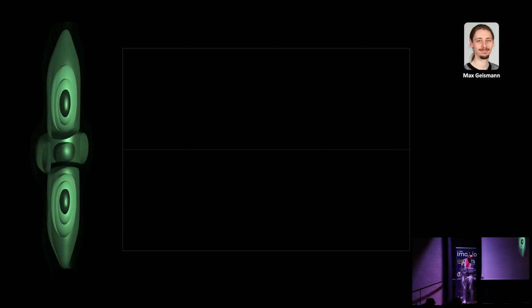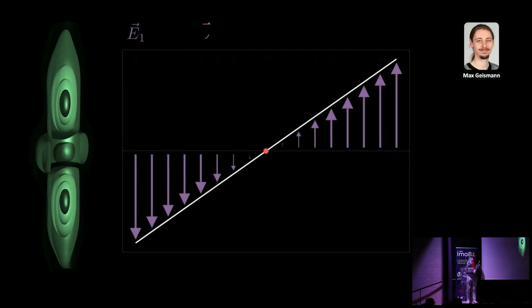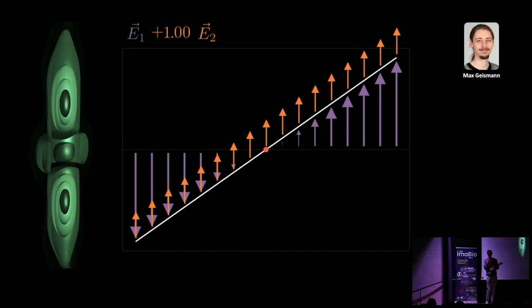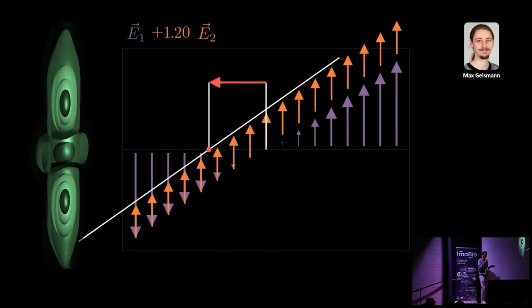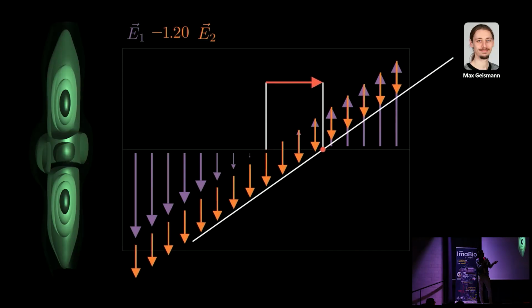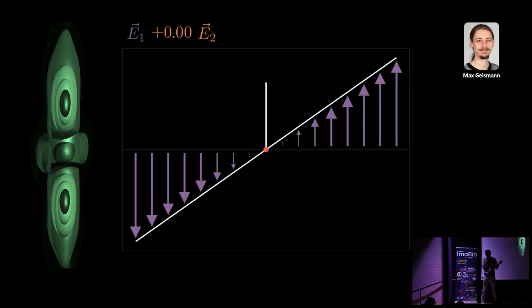And what we did is to specifically work with this beam and use an interferometric approach. So most of the zeros of intensity that you see are a crossing of electric field from negative to positive. So if you overlap this beam with a constant beam, you can just displace the position of the zero, and voila, that's it. This that you see here represents what happens in the actual direction for this beam.